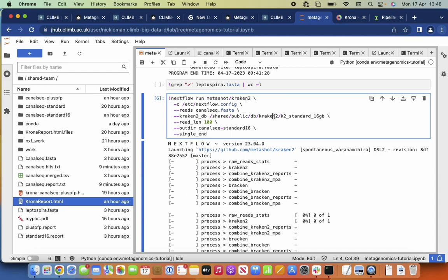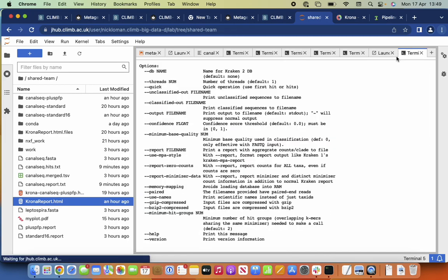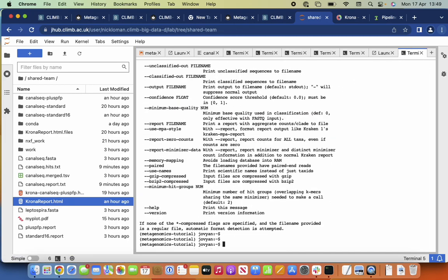It becomes possible to do a 10,000 genome analysis, let's say, of bacteria, where you want to assemble each genome and annotate each genome, things like that. Running Nextflow is very similar to running any given command line. You run the Nextflow binary, you tell it the name of the pipeline you want. I'm using one here called Metashot, which really just runs Kraken and Bracken, and you give it the inputs and the outputs, just like you would with any normal pipeline. So I can show you that running in the terminal. It looks nicer if you run it in the terminal.